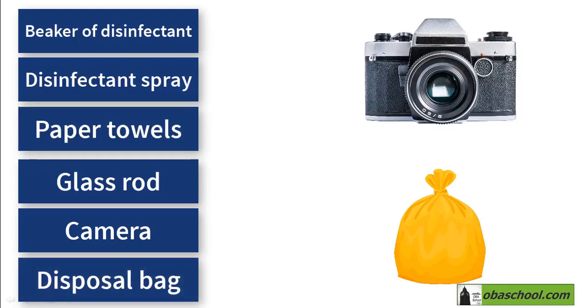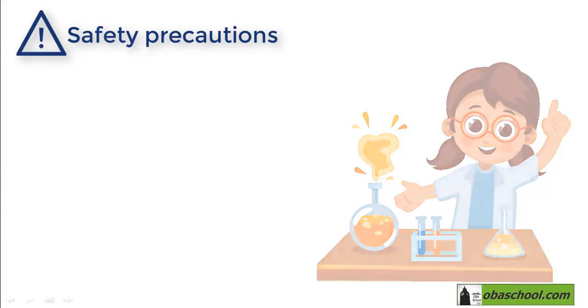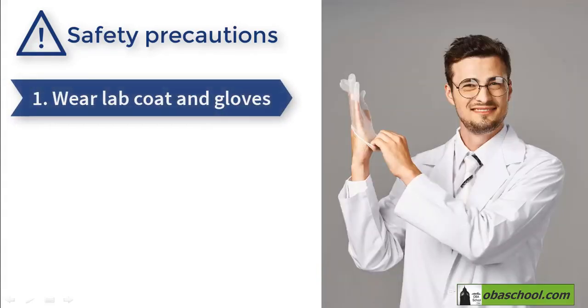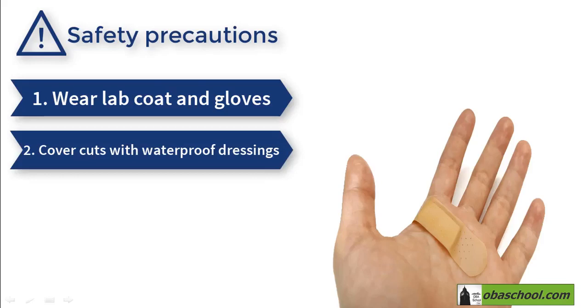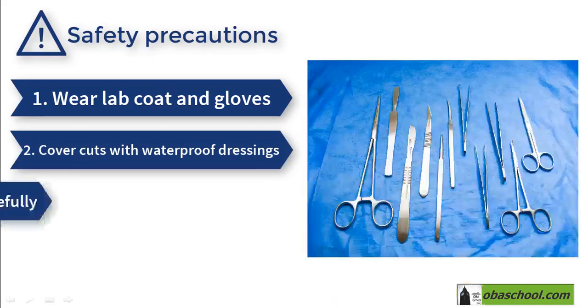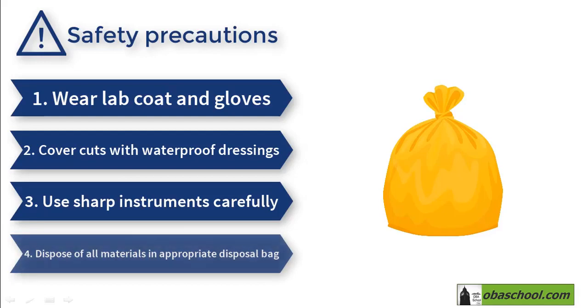As you know, in any experiment carried out, there are some safety precautions that you should be aware of. Some of these are wearing a lab coat and gloves. You should cover cuts and open wounds with waterproof dressings. Dissecting instruments are sharp, so handle them carefully. And dispose of all materials such as organs and plastic gloves safely in a yellow disposal bag.